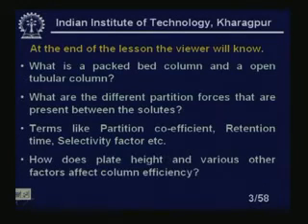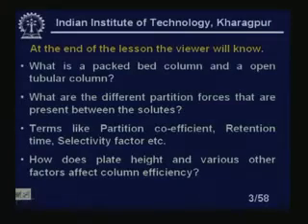We will see what the plate height is and how it and various other factors affect the column efficiency, because the efficiency of the column is very important, not only to know the contents of the individual components of the gas.